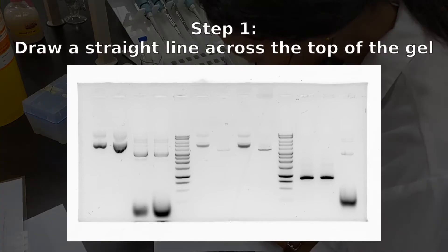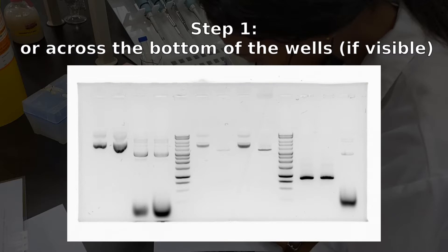For example, the first thing you'll want to do is draw a straight line across the top of your gel, or across the bottoms of your wells.